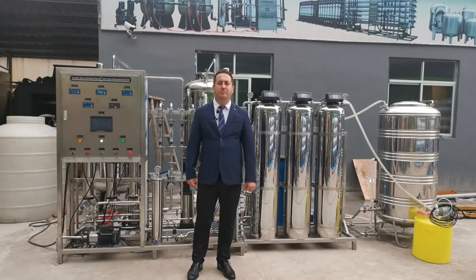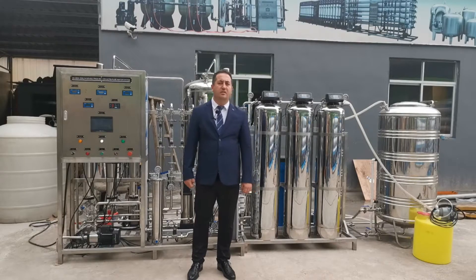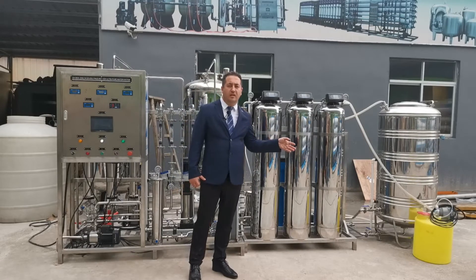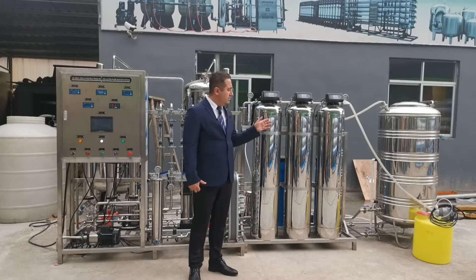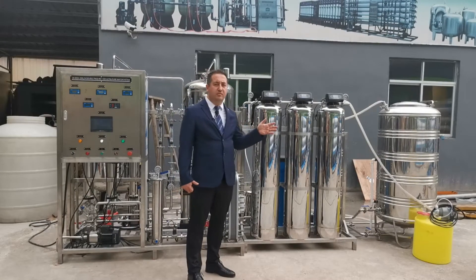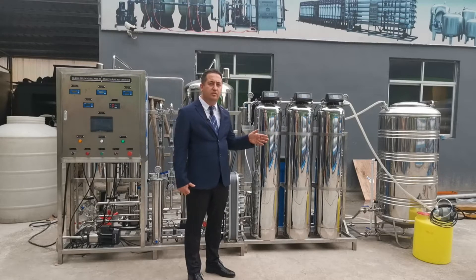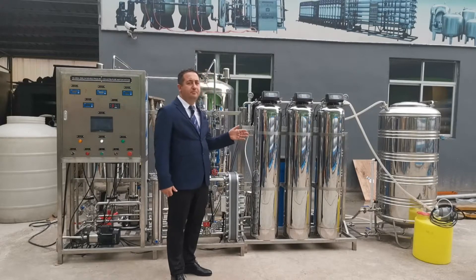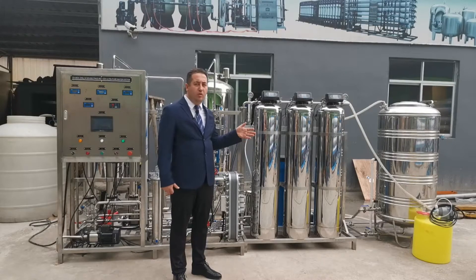This system is produced for our customers in the pharmaceutical industry. The process starts from the raw water tank. This project is all stainless steel. The raw water source is tap water. We send the tap water to the raw water storage tank, and then from the raw water storage tank we feed the system by a raw water pump. In this project all pumps are Grundfos.